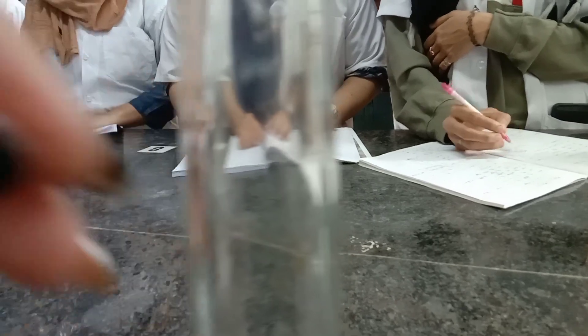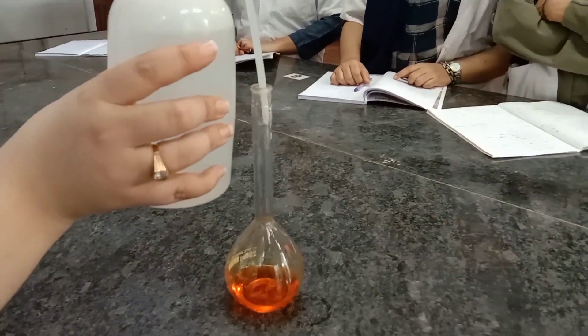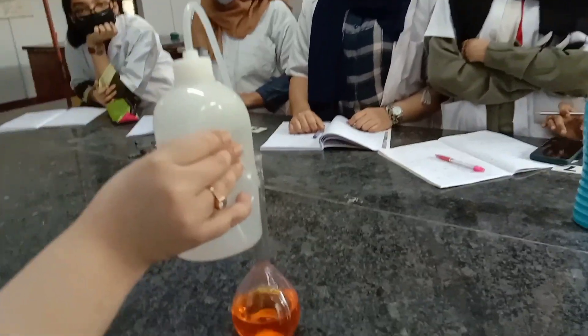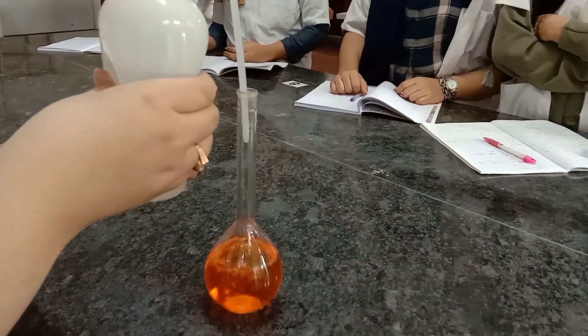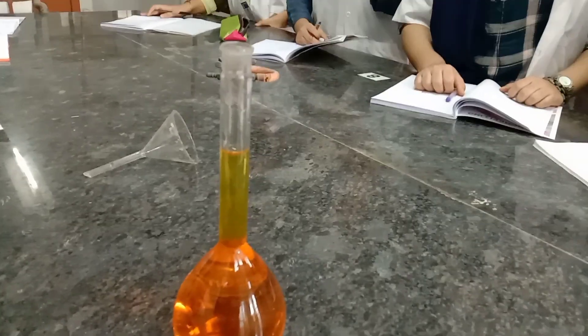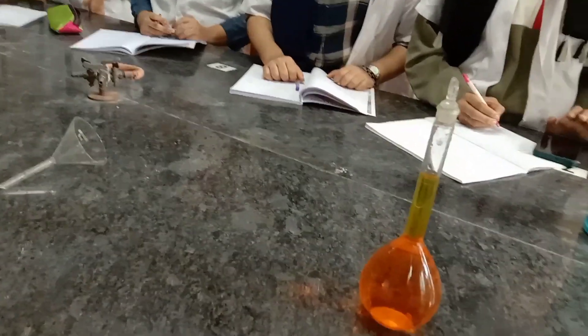This is the mark. We need to make up the volume, and we have to check the upper meniscus as it is a colored solution. Now add water slowly until the solution is made up to the mark. Close it with the lid. We will keep the standard solution aside — please complete the calculation.